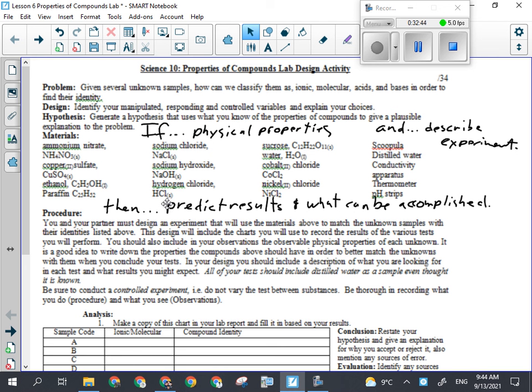All right, what's the last test I run? pH test. Okay, the pH test is also a pretty straightforward test. Take my Hydrion paper, which will come in a vial like this. You can see it's got the color chart on it that tells you what colors correspond to what pH. Take off the cap, and inside are little orange pH strips. You should be able to do 2 samples with each strip. Just tear it in half.